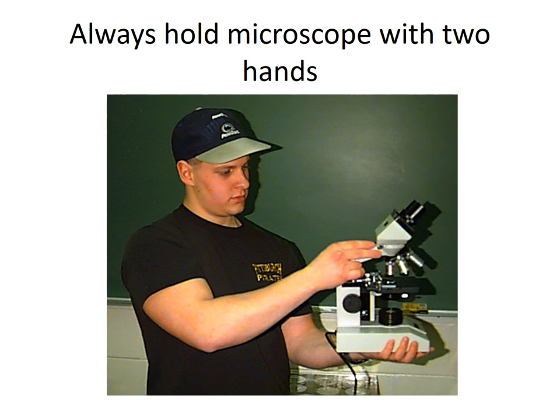In the lab we're always going to move a microscope using two hands, as seen in this image. Microscopes are going to be stored in the back cabinet of the lab, and anytime we move the microscopes from the cabinet to our lab bench — or even at our lab bench — we want to do that using two hands. This individual is holding the arm of the microscope with his right hand and the left hand is underneath the base. This is how we always want to move the microscope.